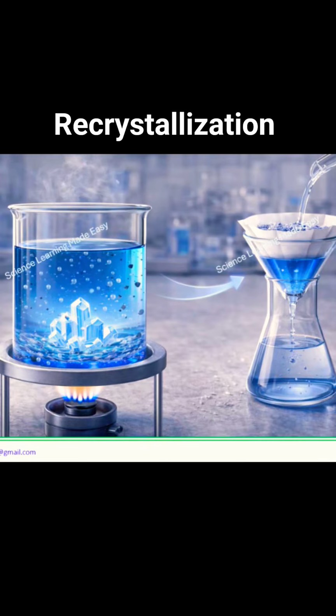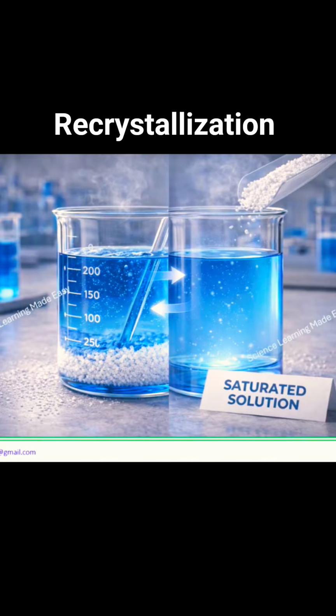pure but contains small amounts of unwanted impurities, and we need to separate that solid into a pure, crystalline state. The entire process hinges on one critical concept, the saturated solution. Think of a saturated solution as a chemical capacity limit.